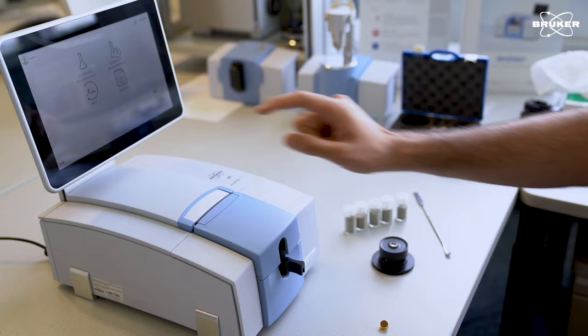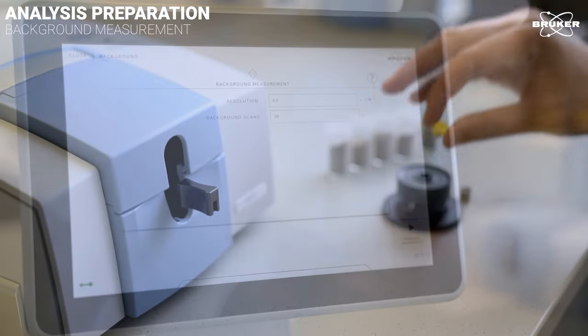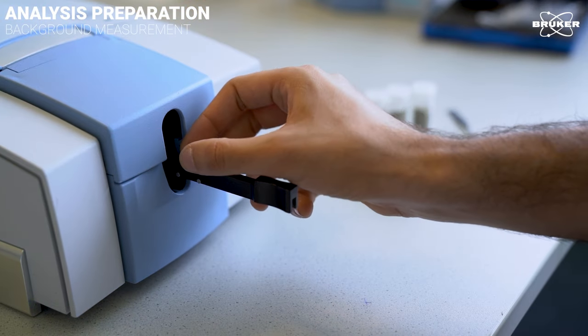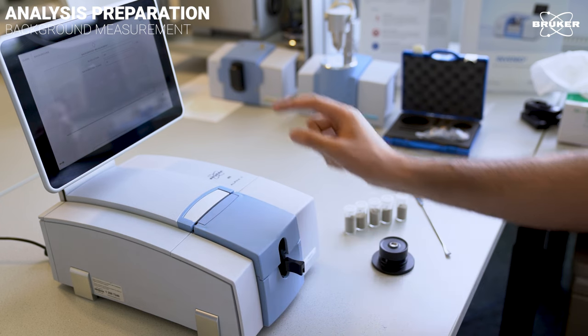But first, we have to measure the background to prepare the device for the actual sample measurement. We can then use this background for multiple samples in quick succession. A gold mirror will serve as a reference and we place it into the DRIFTS module. Next, we follow Bruker's simple step-by-step guide in the Opus Touch software.